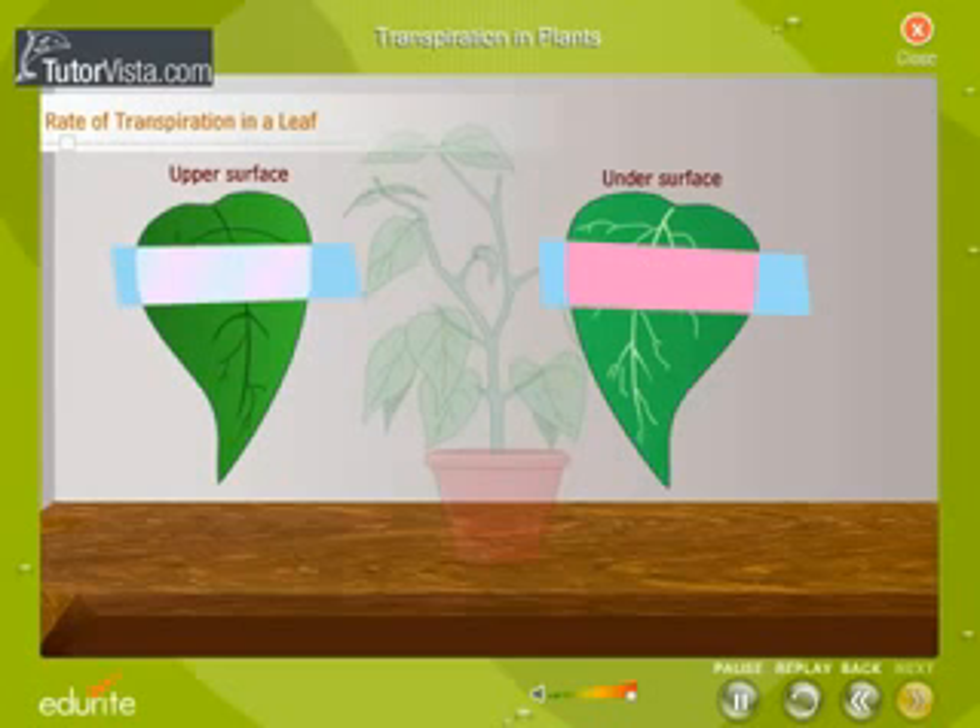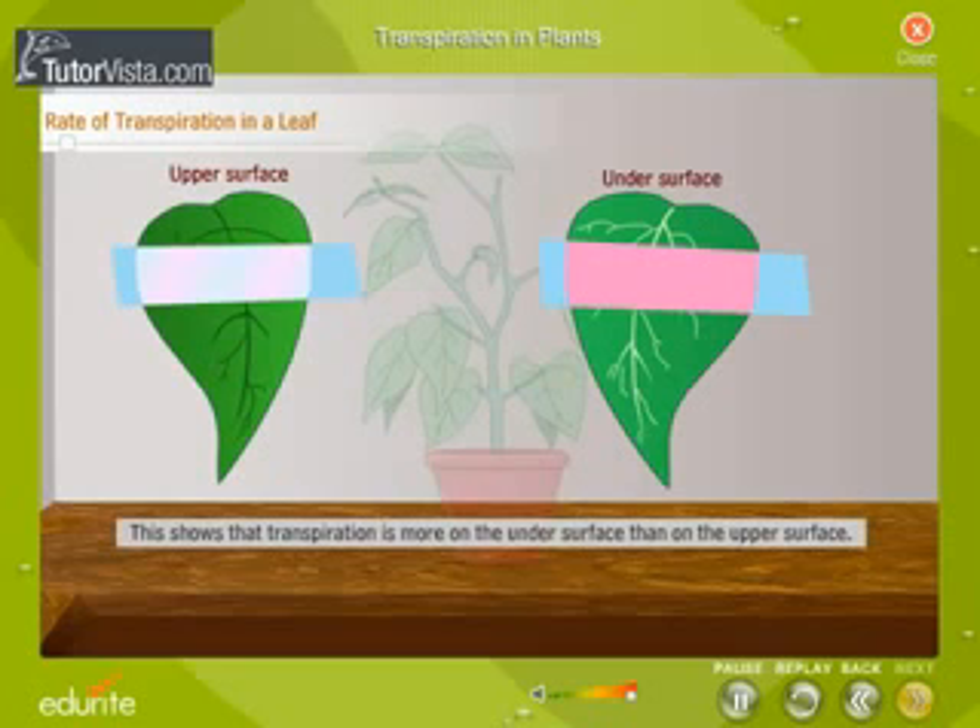The strip placed on the lower surface turns more pink than that on the upper surface. This shows that transpiration is more on the under surface than on the upper surface.